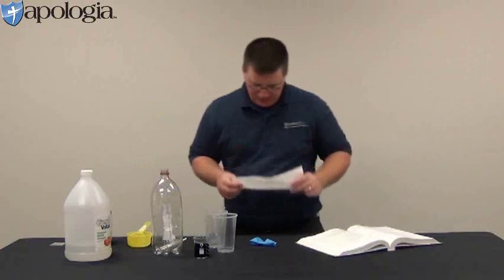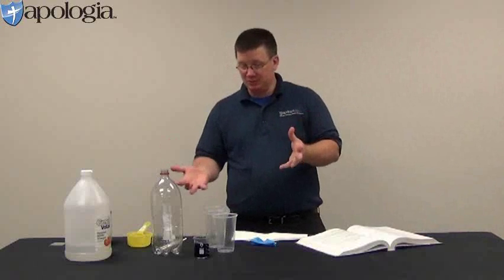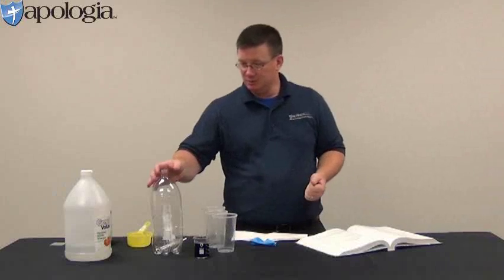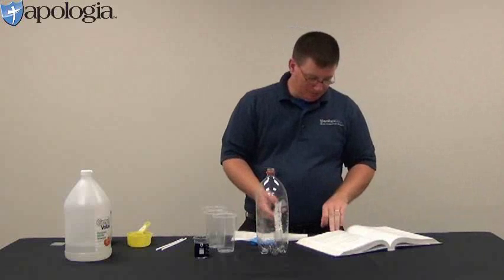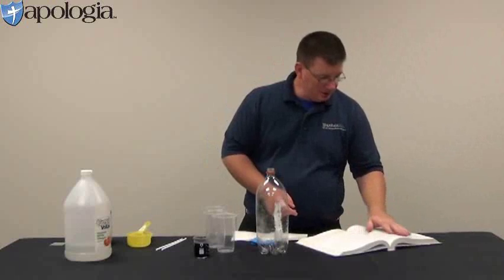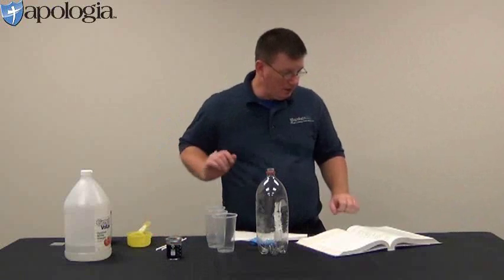All right, the next experiment here. This one, it may take you a few times to get right, okay? I'm experienced with this stuff, and it still took me a couple of takes to get this right. So let's make sure we take our time. If you mess up, it's no big deal. You do need about, let's see, we are on step number 11 on the next page, page 300, and that's step number 11 is this solution here, letting it cool down.